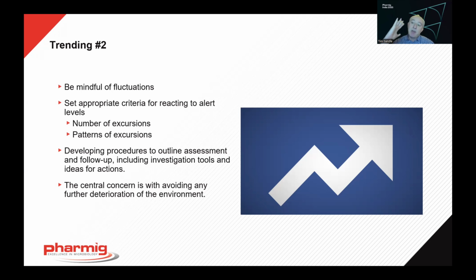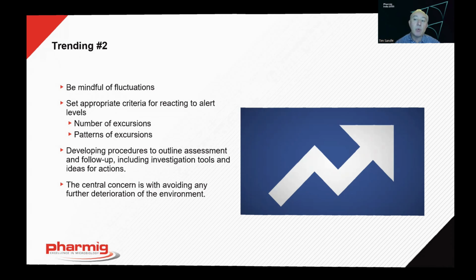It's the big shifts that we want to be focusing on. But it's useful to get an understanding of what types of excursions, what types of patterns we want to be most concerned with, and how we are going to follow that up. Not let things drift too far that they become a fundamental problem.